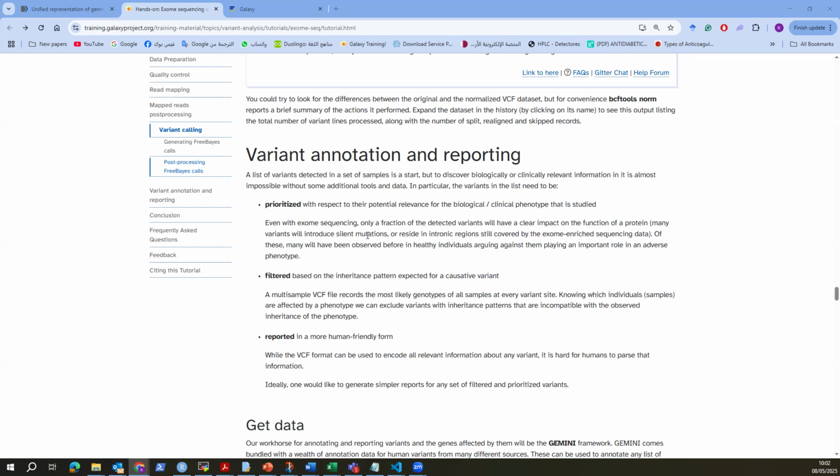And so in the annotation, the term is prioritized. So we prioritize those variants. We know the variants associated with diseases or the pathogenic changes of the protein. So we detect those, and then because we also have a diploid system and a family, the father and the mother, if those variants exist in the father and the mother, each one of them or both of them, and the variant does not hold a pathogenic effect, this also can be waived.